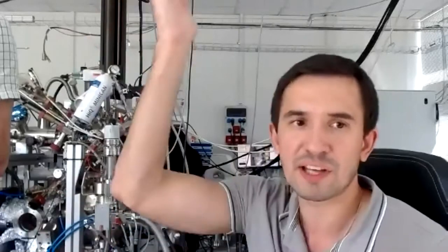Then you should take the sample from this UHV manipulator and move it up again to leave the space for NAPXPS to come.